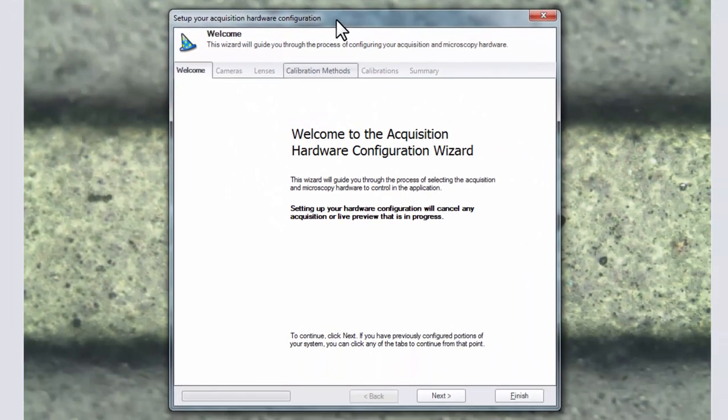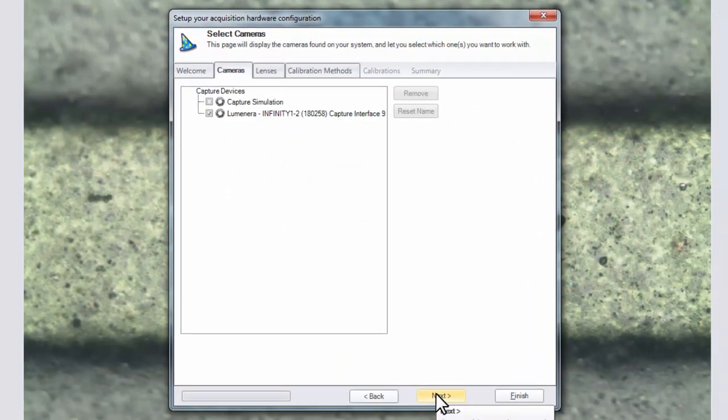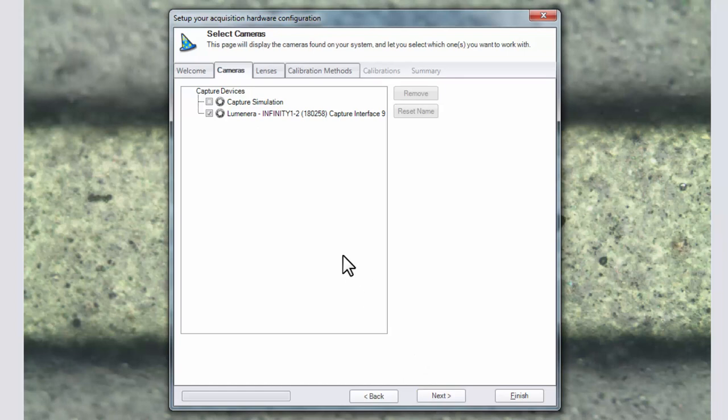First read the introduction and click the next button. Then choose the capture device that you plan to calibrate with your lens. Click next.